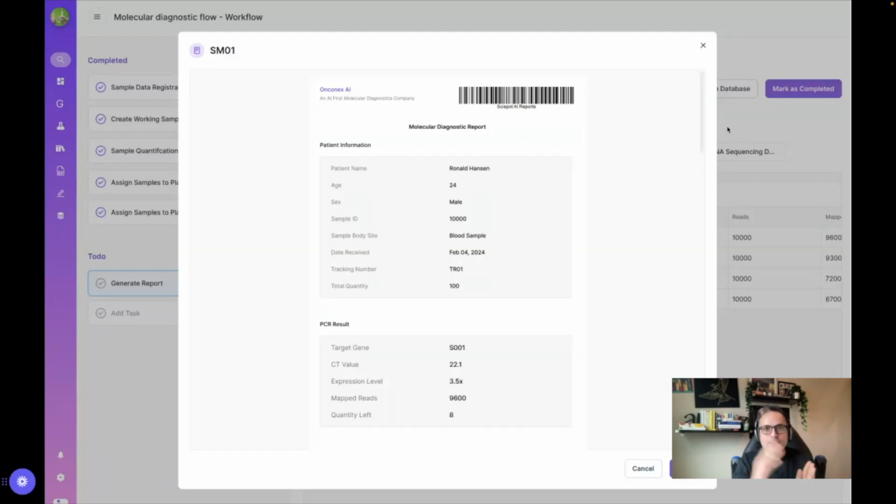One is you just use the AI report that automatically gets generated for you, or you can fine tune it based on natural language and say, only detail out the experiment that I ran on these samples. Do not cover everything. Or slice this data by the plates and the positions that I have, so I can make a summarized report for that particular thing. So it all depends on the use cases. The prompts are limited for now, but our goal is that you can edit this report manually as well. So once the AI generated report is there, you can edit the report manually too if you want to change this, before sharing it with your collaborators and partners.